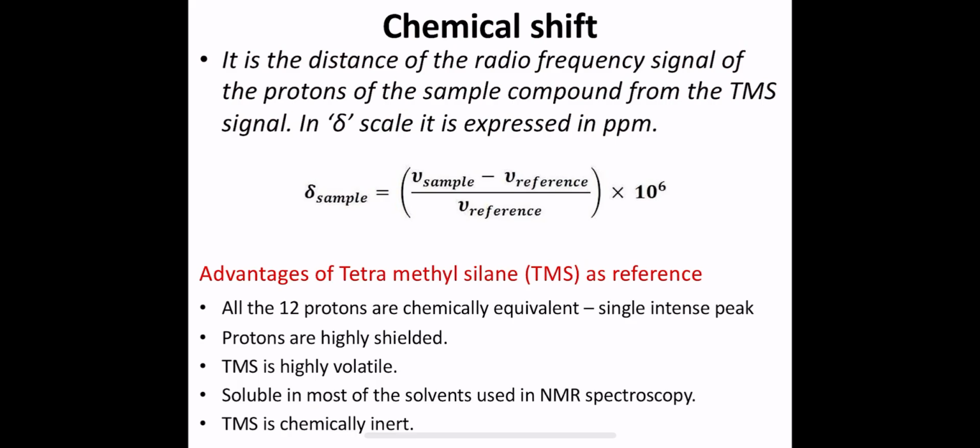So this confusion will be there. For that reason, the solvents we use in NMR spectroscopy preferably should not contain any protons. The solution should be free from paramagnetic and insoluble impurities, and usually deuterated solvents are used. Deuterated means the hydrogen, that is the proton, is removed and replaced by deuterium.